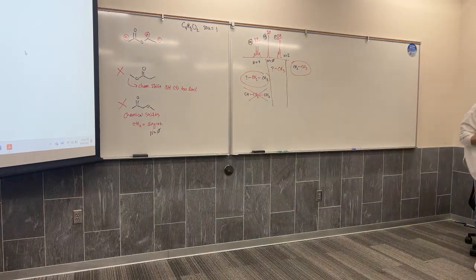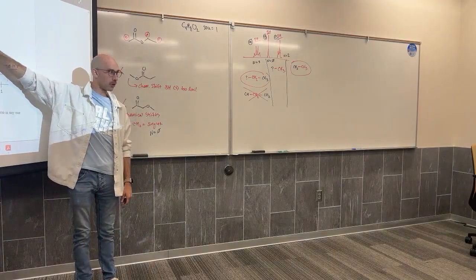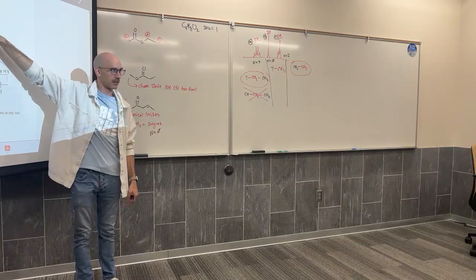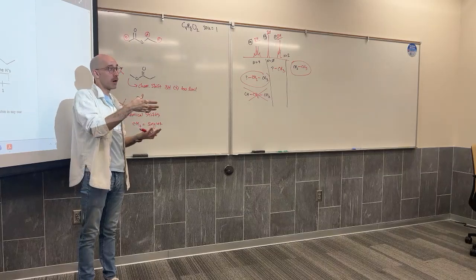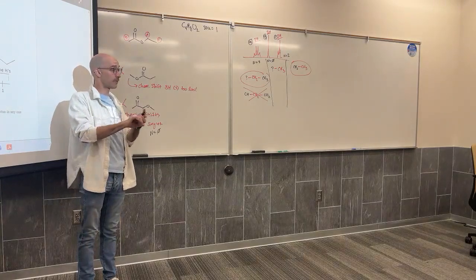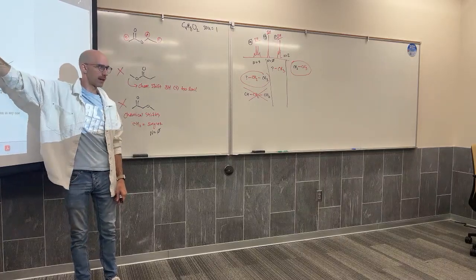Can you explain one more time how to rank if they shift right or left? Yes. Like the priority, I guess. No priority, unfortunately, but you can use this as a template. If the hydrogens are very close to an electronegative atom, it shifts the signal more to the left. If the hydrogens are not very close to an electronegative atom, or if they're just adjacent to an alkene, an alkyne, an aromatic ring, not a lot of heteroatom there, but there is functionality. That functional group still de-shields it. So the closer you are to a functional group that is not very close to the heteroatom, more to the right. The closer you are to the heteroatom, more to the left.